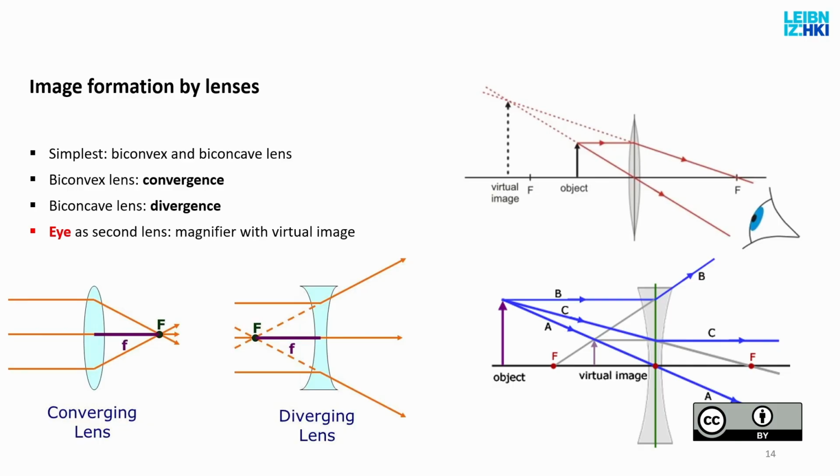If the image was formed on the other side of the lens, where I can actually put, let's say, a screen or a camera, that's called a real image. But either way, with a simple lens like that, I can magnify things. And this is a loop. This is how a loop works, where you look through it and see the stem or the feet of your insects magnified.